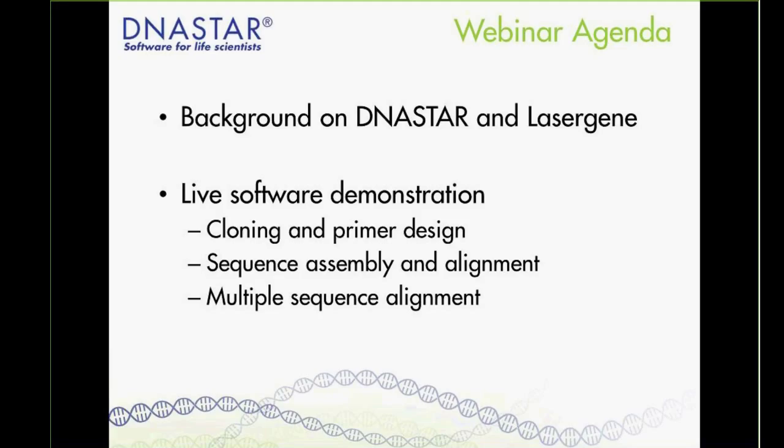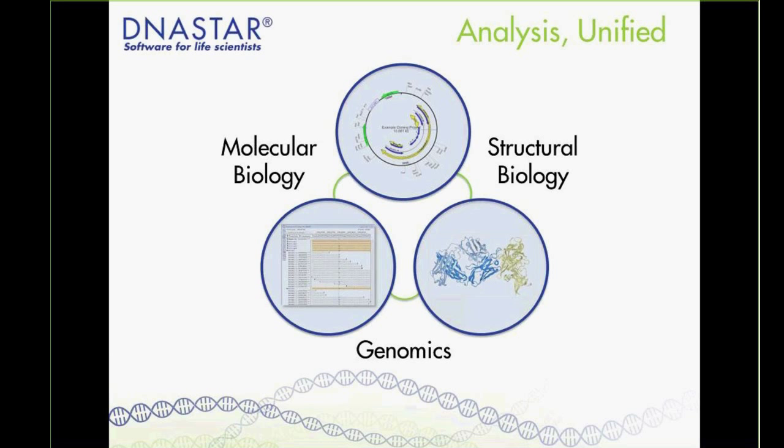software for. These include cloning and primer design projects, Sanger sequence assembly and alignment, as well as multiple sequence alignment and phylogenetic tree generation. DNASTAR has been in business for over 30 years, and we've come a long way during that time. Founded in the lab of Dr.